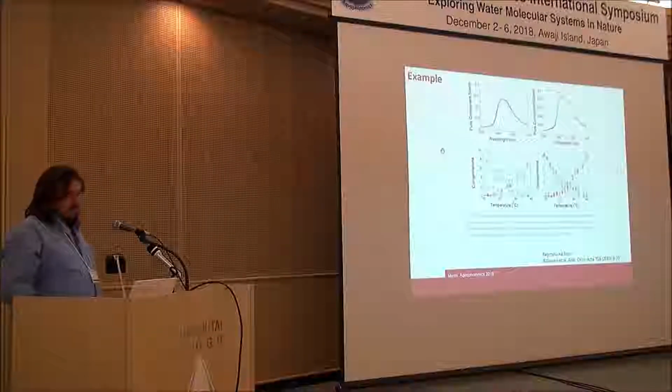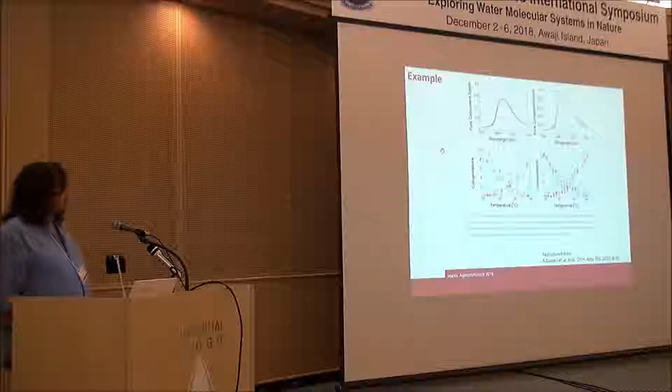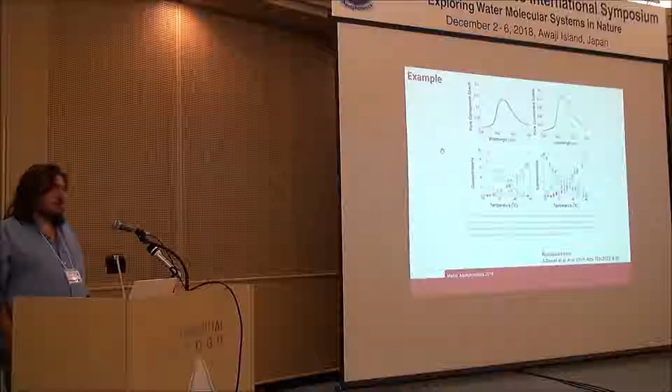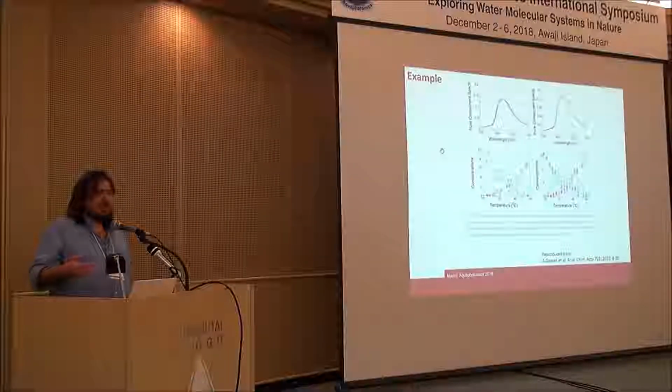And as an example, also here, I was taking a paper by Rumiana and Ifa again, about the possibilities of using multivariate curve resolution on data collected on solutions at varying temperature.